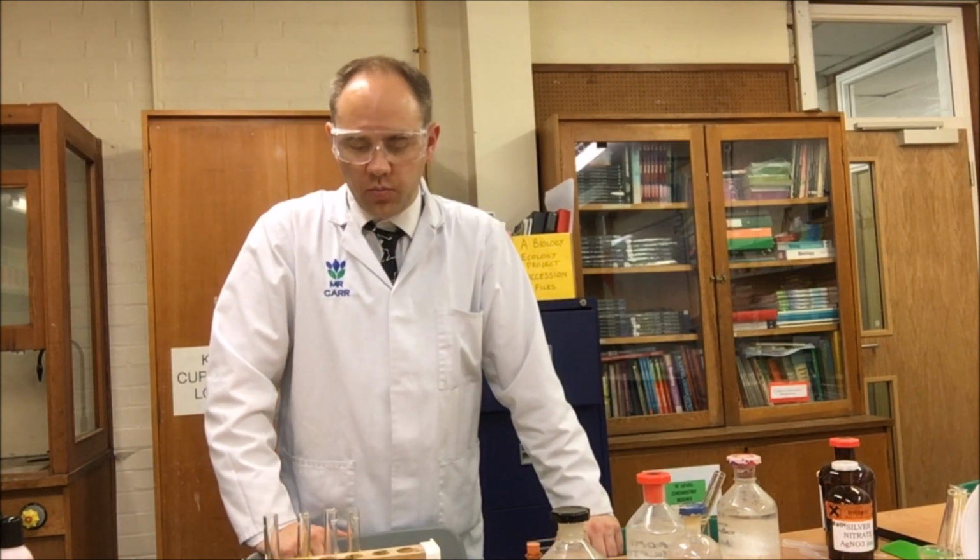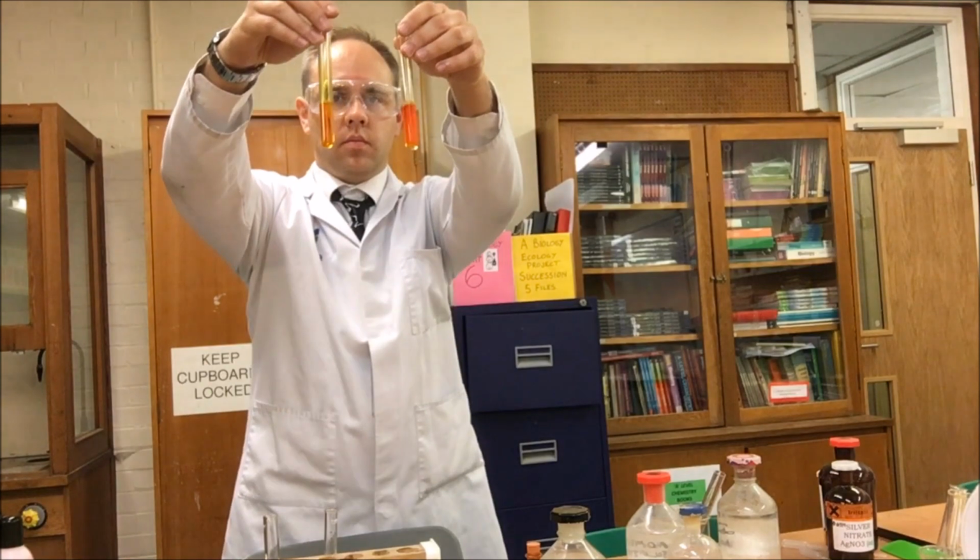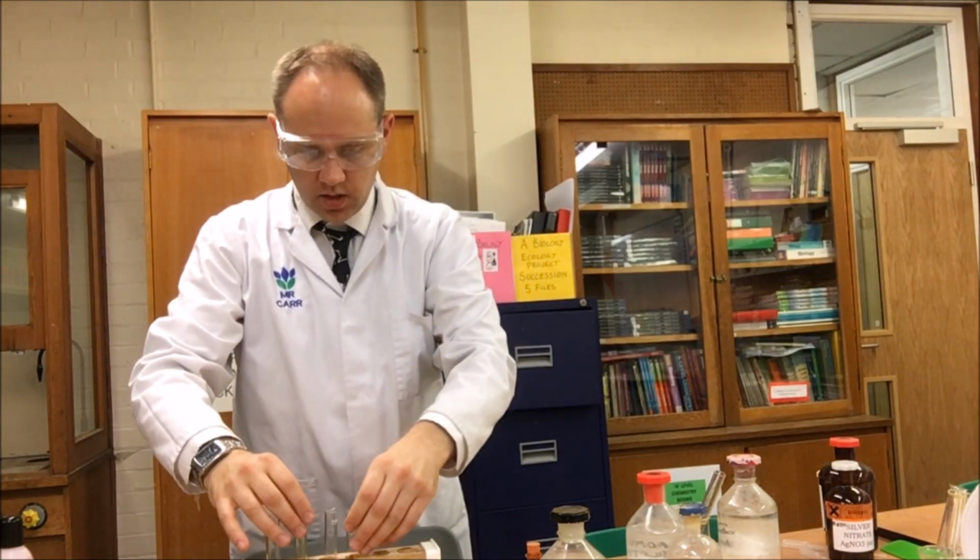Now then, if there is a carbonyl group present, then we should see a nice precipitate in each of these, which of course we know we should. I'll zoom in a short while.